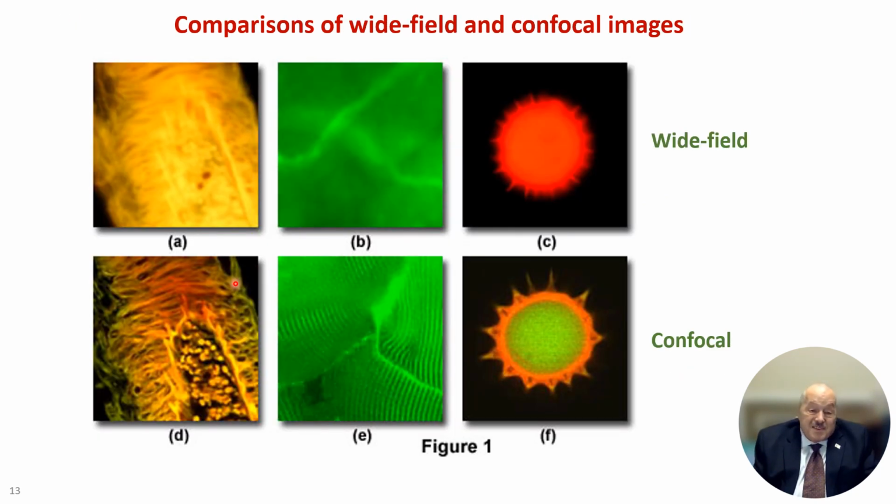Oh, and I just wanted to show you a couple of other examples because you get entranced by them when you start going on the web and you see how much more detail you can get from a confocal image than you can from a wide field image.